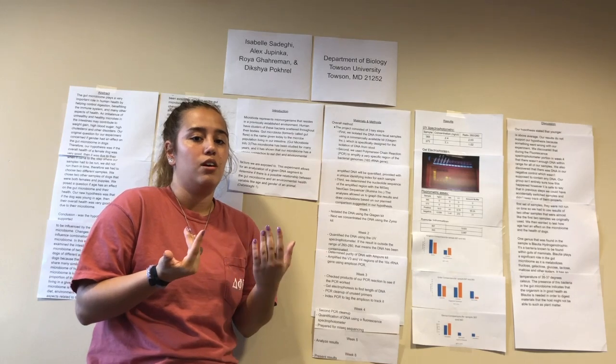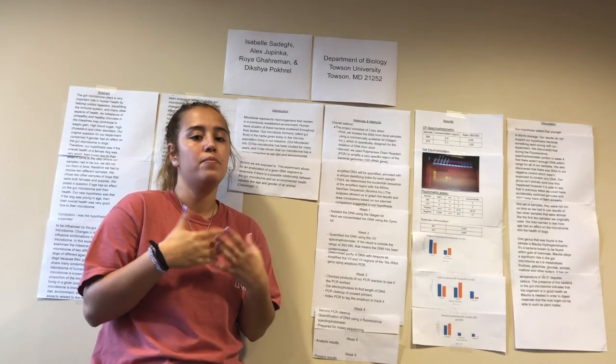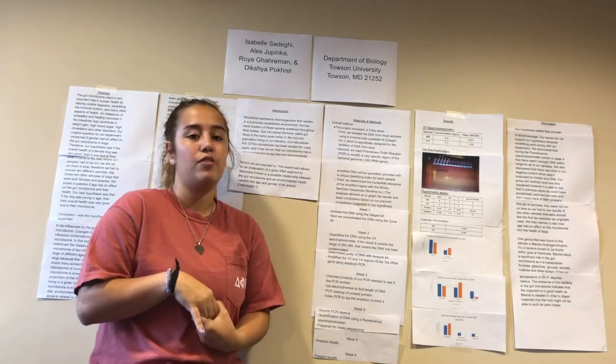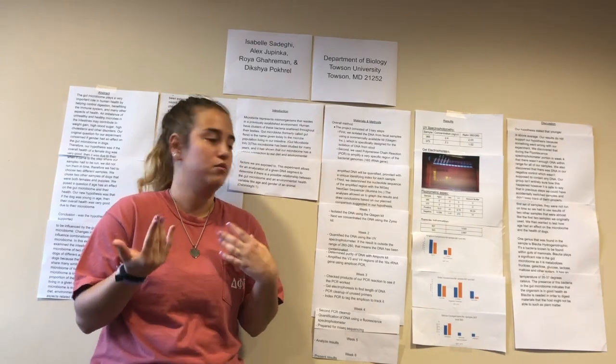And discussing our positive control, most of our organisms found in our samples were unidentified organisms, about 51.52%.